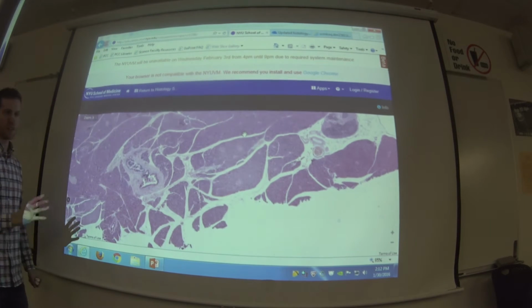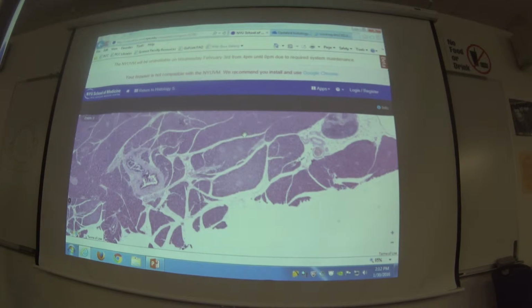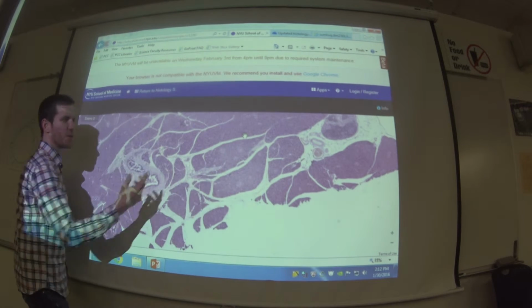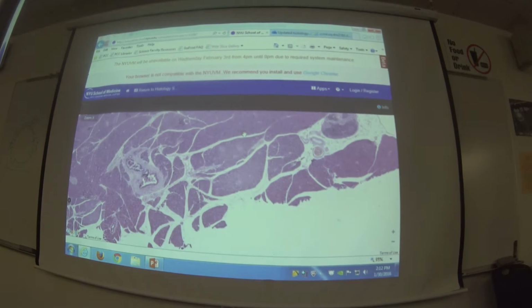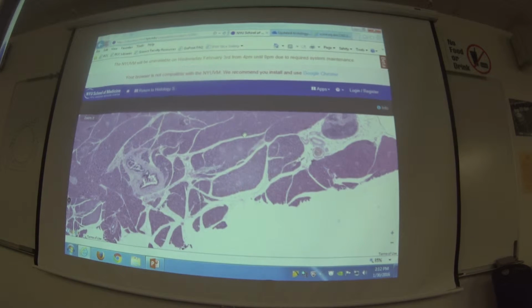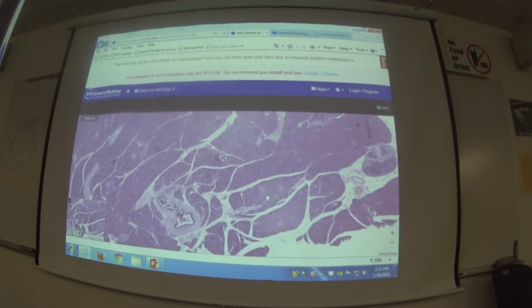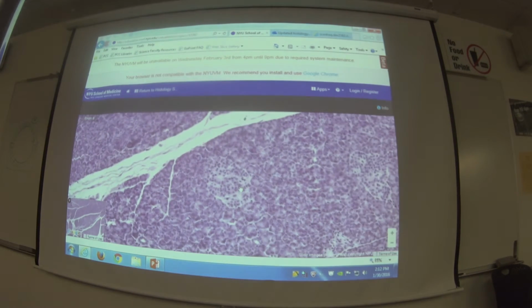But you see how it just looks like a bad paint job, like in a house. You didn't cover a couple areas. When you're painting over white, it looks a little lighter. That's kind of what the islets look like. So first, the biggest mistake people make, like with a lot of things, is we love to get really close to things with the microscope, but that's going to make it harder on you. The further you are away, the easier it is to see color contrast. When you're really close, it's very hard to see the big picture of color. So I encourage you to stay far away, just like this. And then when you think you see a light region, go for it. And there we go.